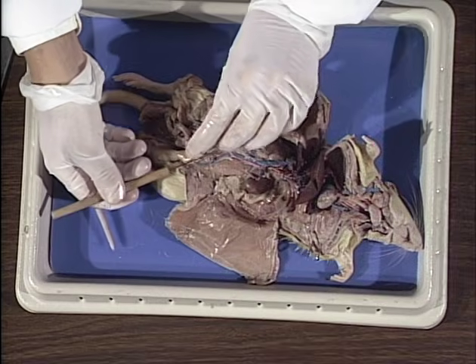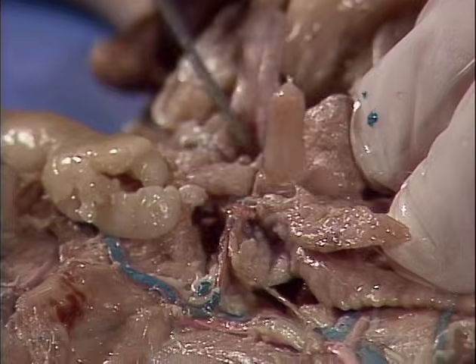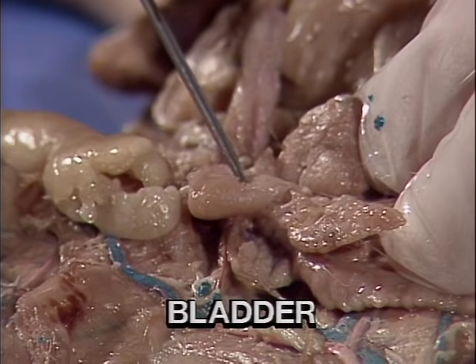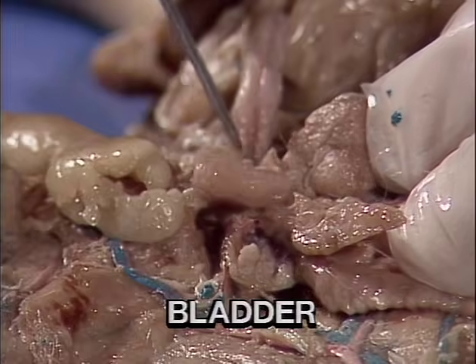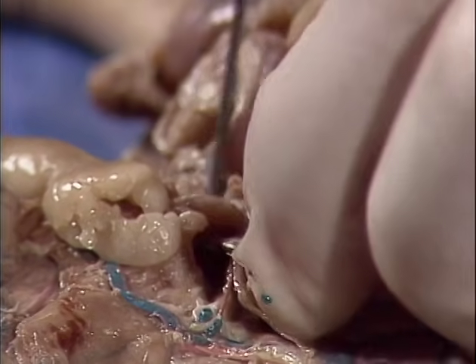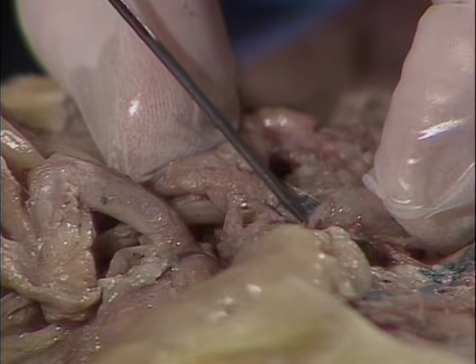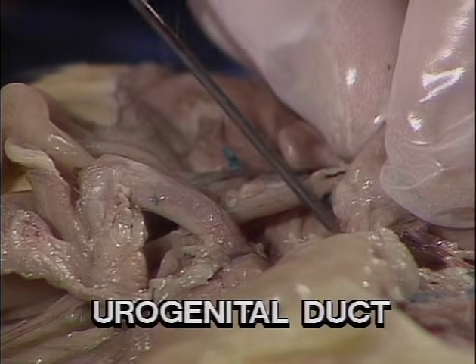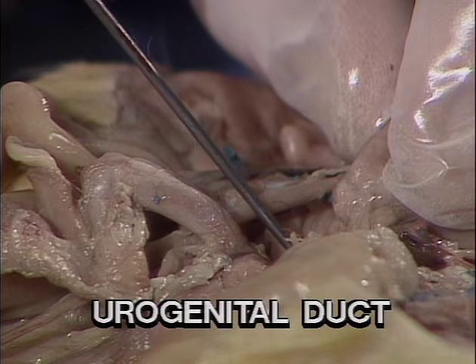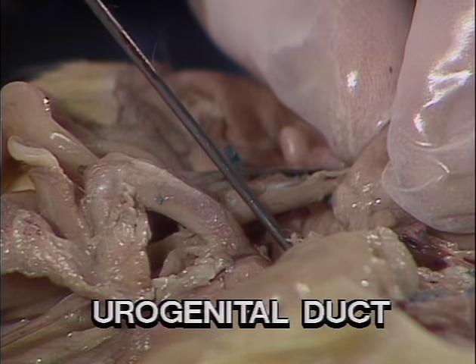We can follow it down to the bladder. In the preserved rat, the bladder appears as a hard, constricted structure. From the bladder, the urine will leave through a short tube known as the urethra. It will join up with the urogenital duct, which will carry the urine to the outside of the body.